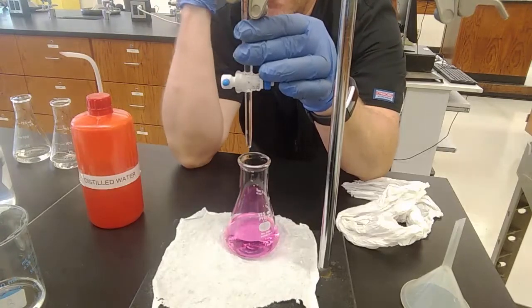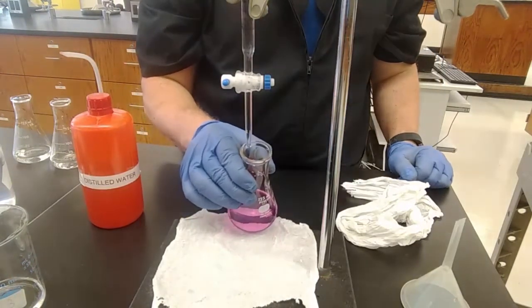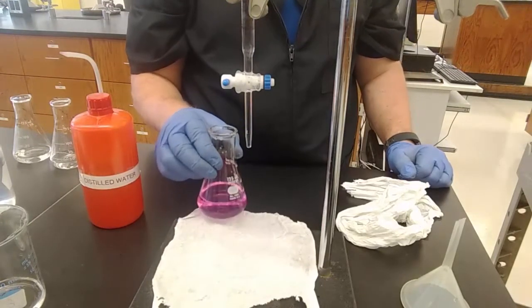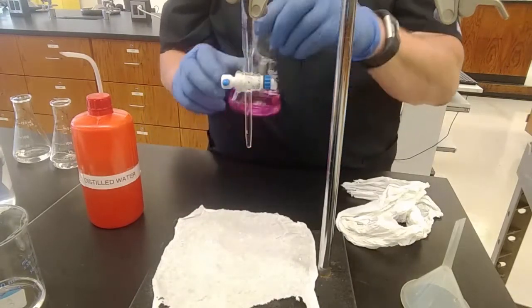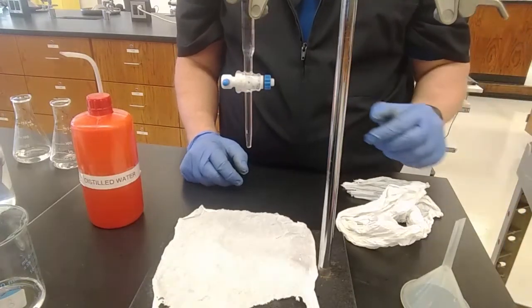17.39 milliliters, knowing that is going to make it a lot easier the second time around. That took me 17.39 milliliters. All right, so we're good. Again, if I took a drinking straw and blew into the solution, it would turn back colorless because of carbon dioxide in the air. We'll see if it turns back colorless by the end of my other two titrations.